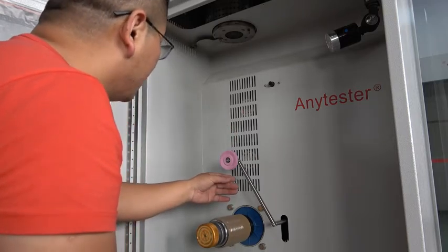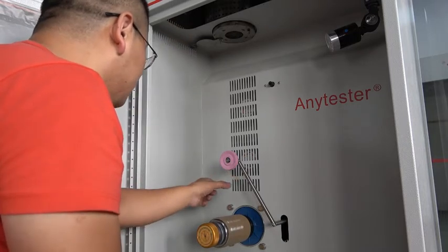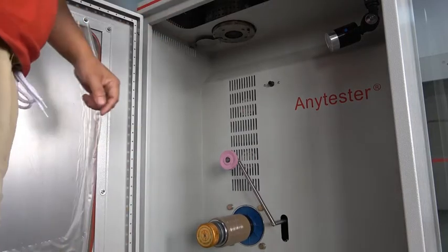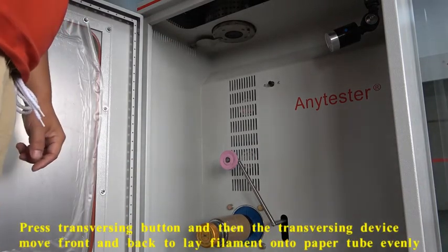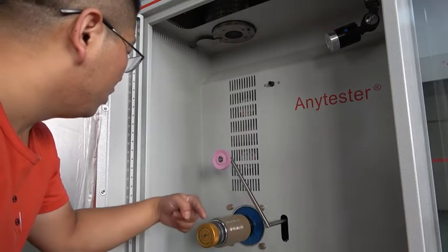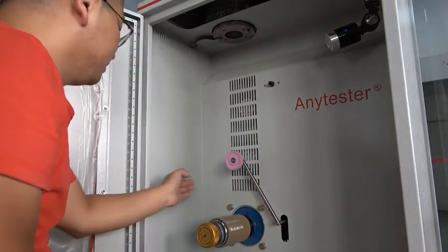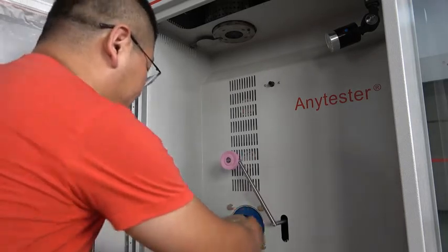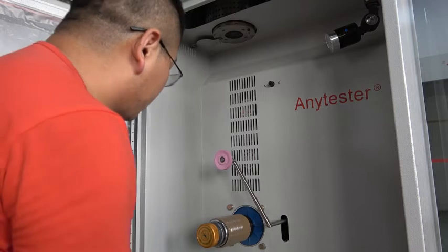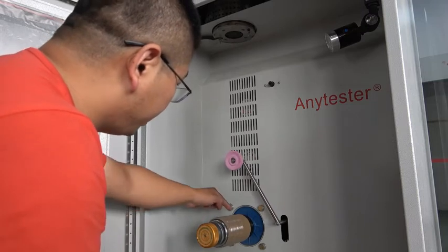Now the filament is wound onto the paper tube. Guide the filament using the traversing roller, then press the traversing button. The traversing roller will move back and forth. In this way, the filament can be wound onto the paper tube evenly.